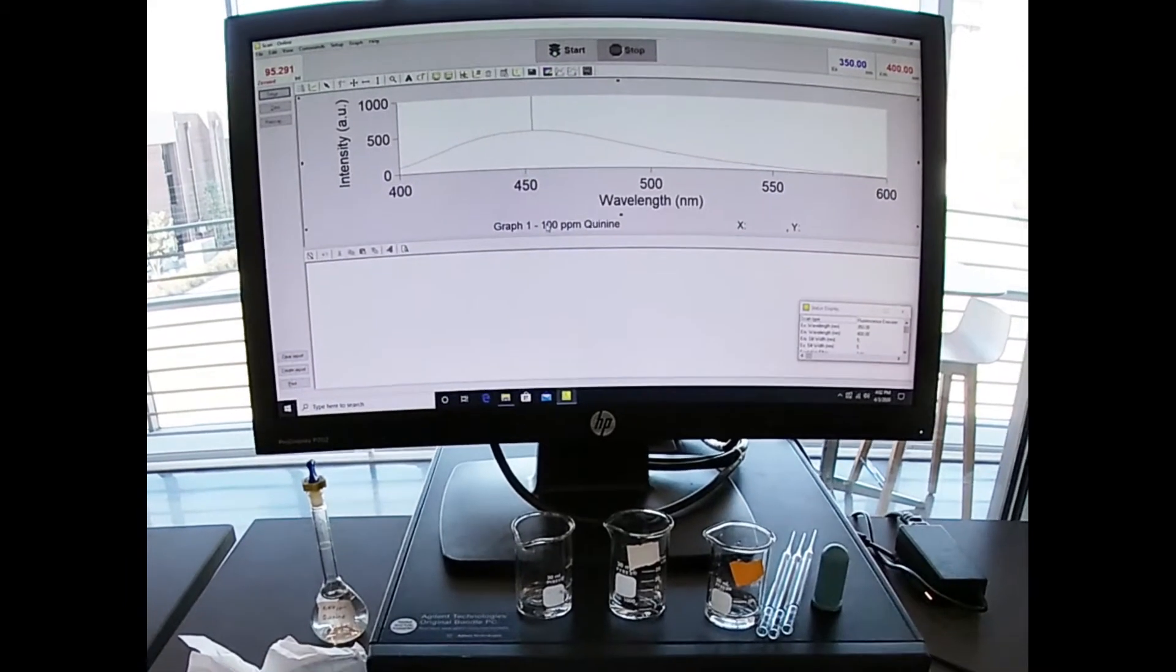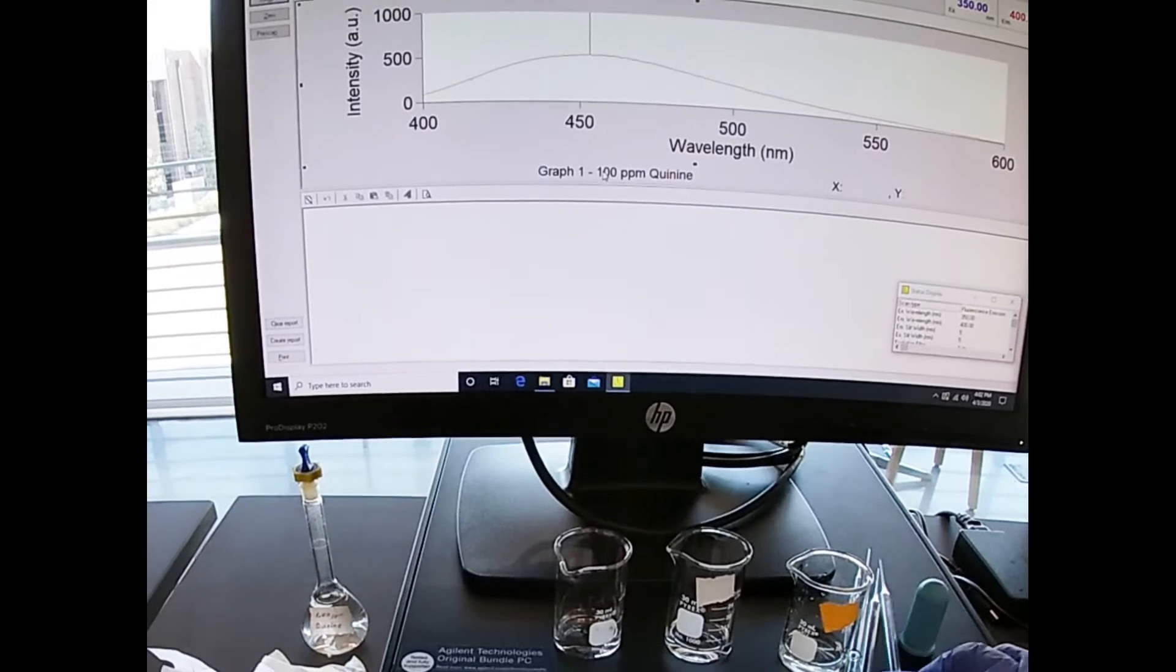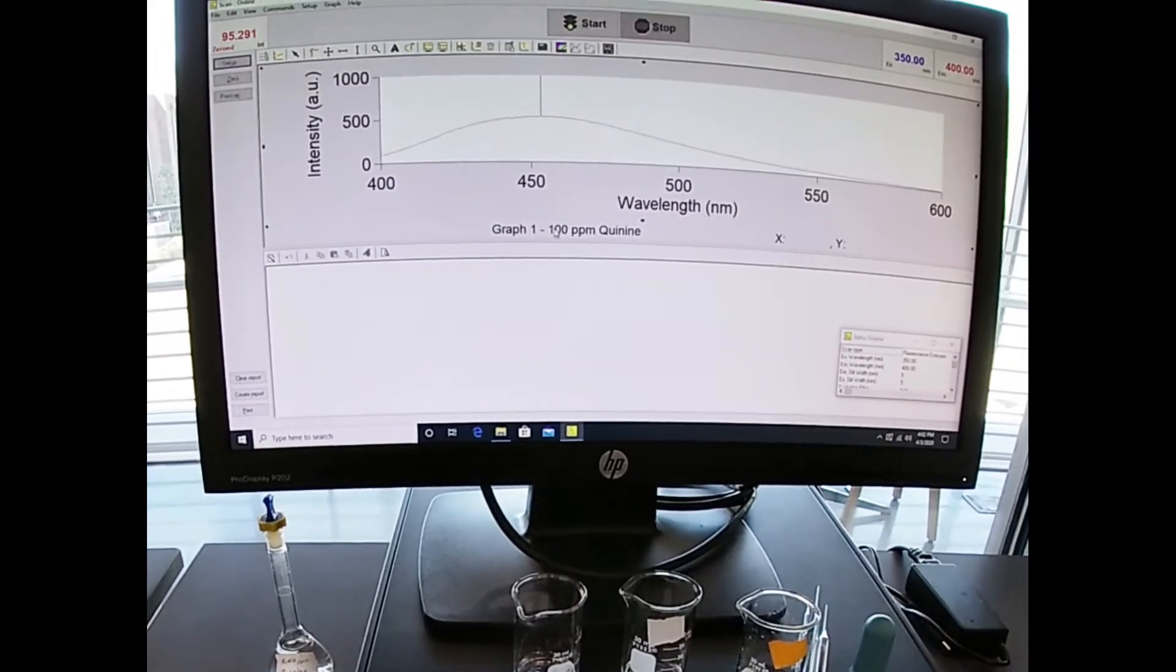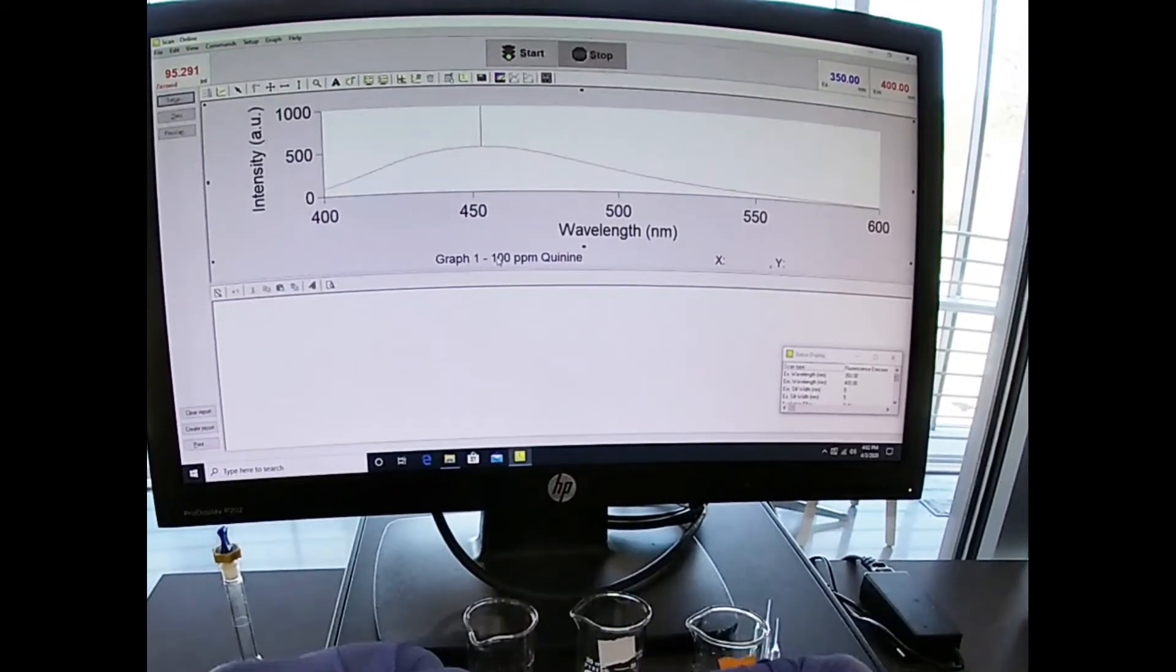We're going to start with a blank, then measure the reference sample, and then the urine sample. I have these labeled. Our reference sample had the white label, our urine sample had an orange label, and we have no label on our blank.